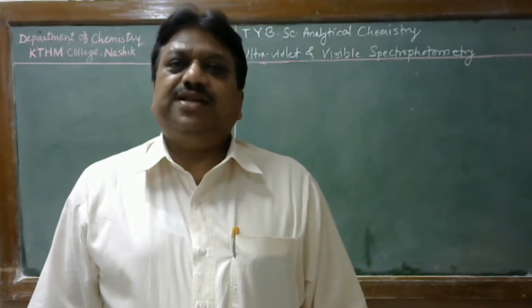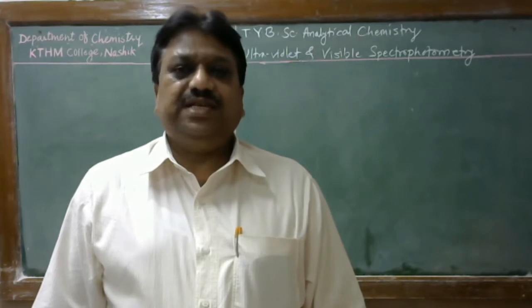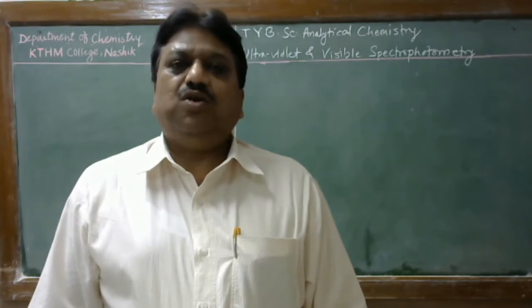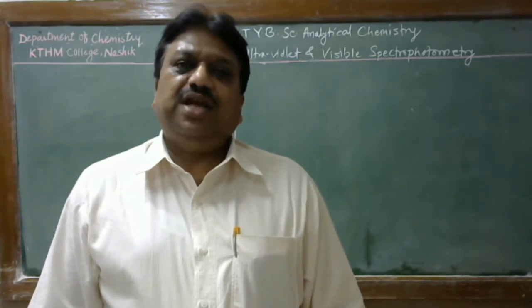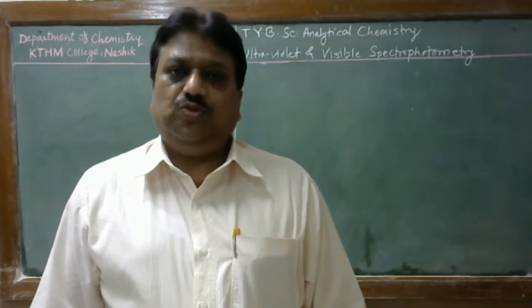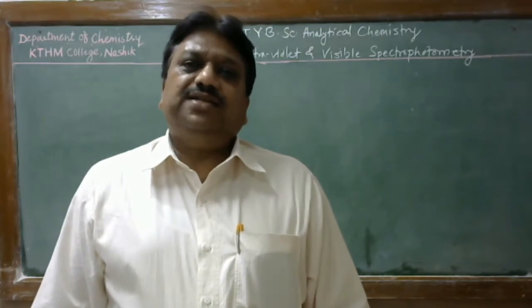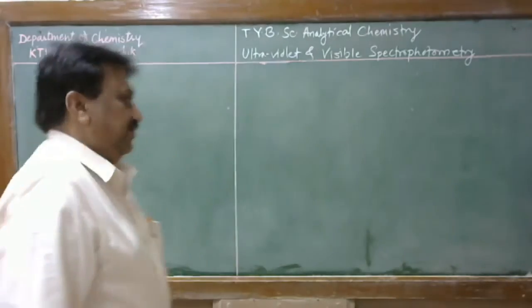Students, in the previous lecture we discussed the instrumentation and working of the single beam photoelectric colorimeter, the single beam spectrophotometer, and the double beam spectrophotometer. In today's lecture we discuss simultaneous determination of two or more components present in the mixture.